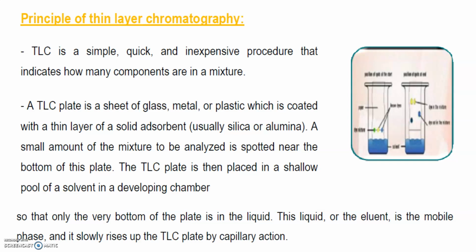A TLC plate is a sheet of glass, metal or plastic which is coated with a thin layer of solid adsorbent, usually silica or alumina.